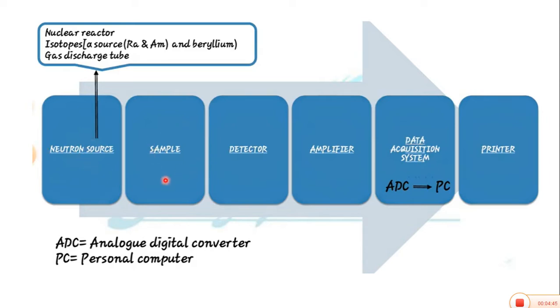The other thing is the sample material. As I discussed with you last time, the sample does not require comprehensive pre-treatment. There is only simple treatment like purification, so that no extra dust or particles will be present. The sample preparation methods that we use in atomic absorption spectroscopy are not used here.